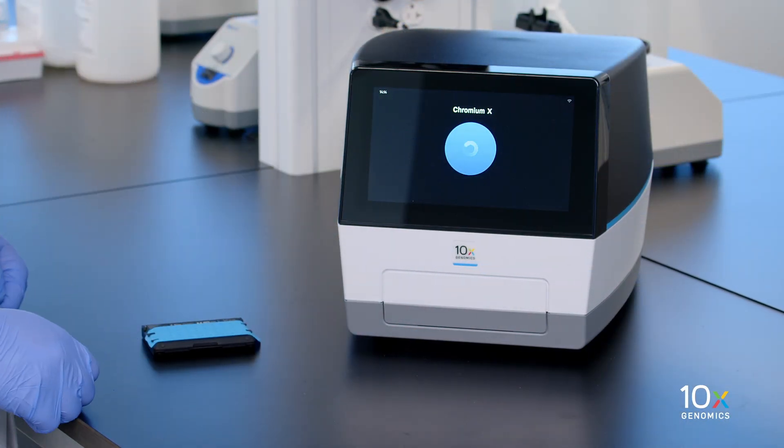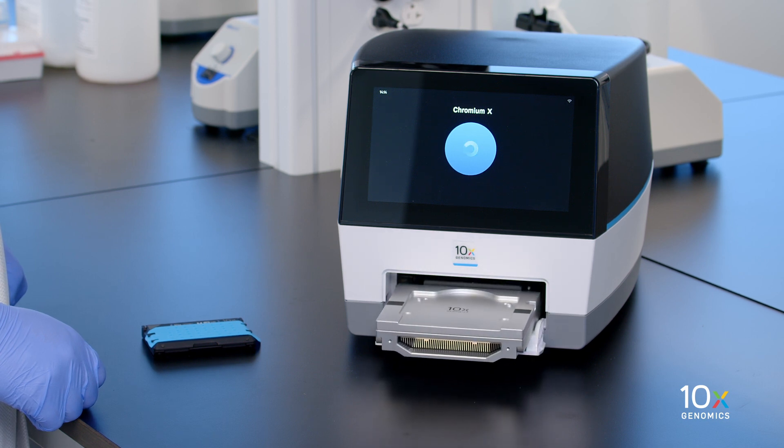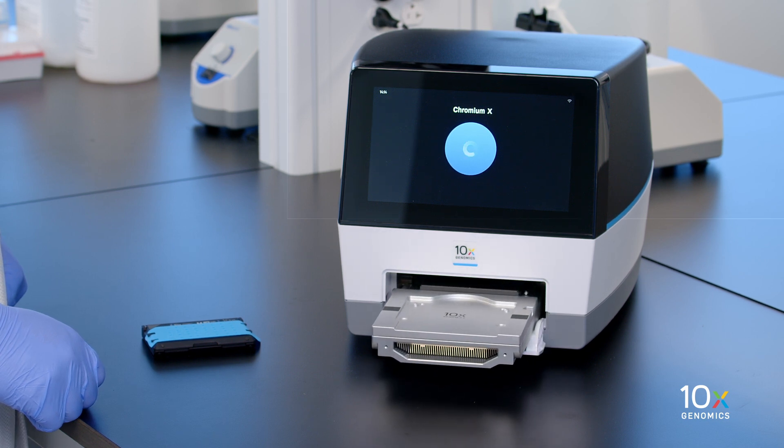Press the eject button on the touch screen to eject the tray. If the eject button is not touched within one minute, the tray will close automatically and the system will require a few seconds before the tray can be ejected again.